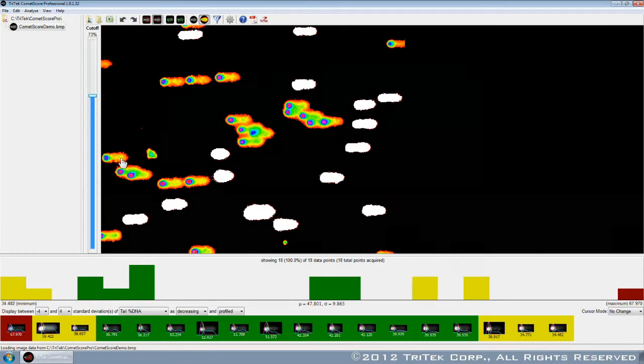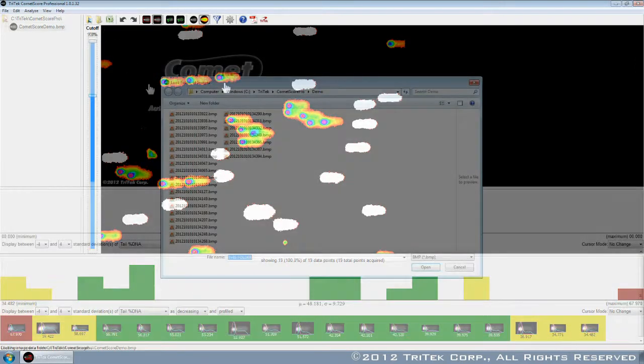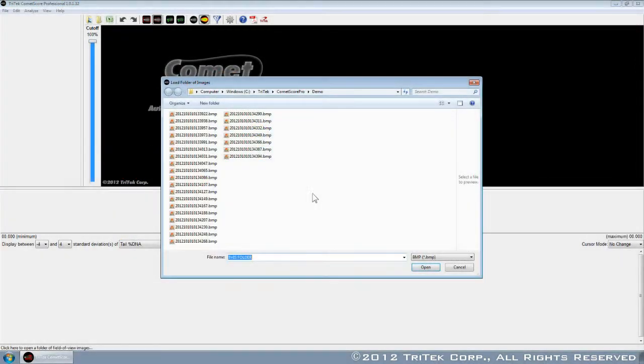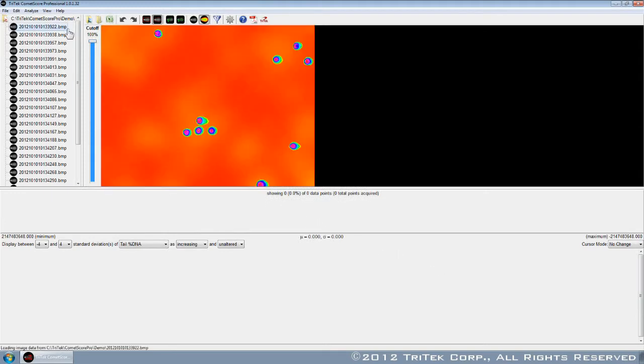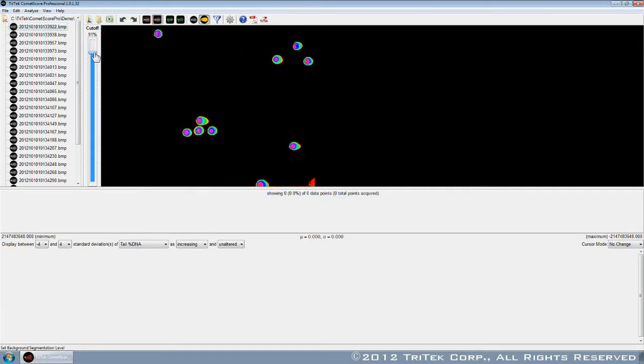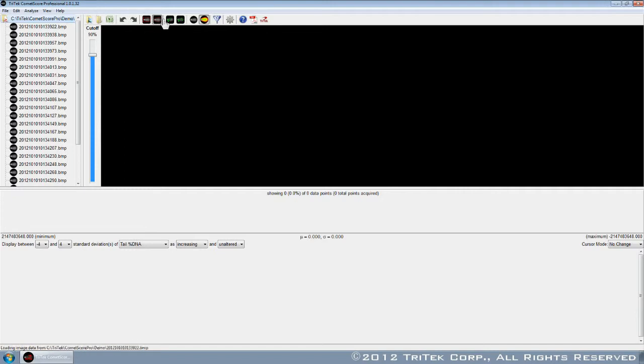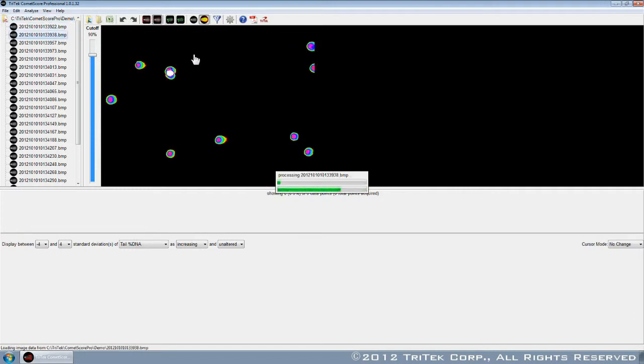When you're ready to move on to full automation, take advantage of CometScore Pro's state-of-the-art zero-click scoring technique. Simply load a folder of images, set the background level, and start the analysis. The comets are extracted and scored in a fraction of the time.